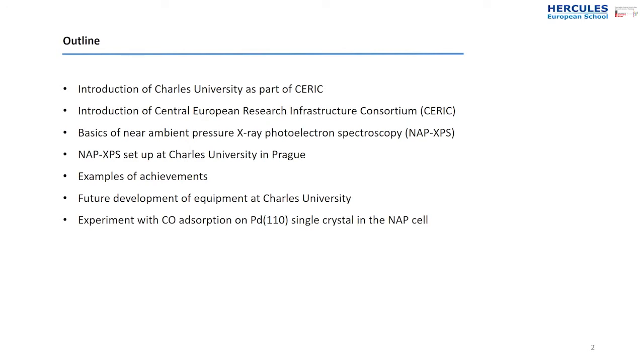I will also talk about the achievements with the other users, the other groups, because it's based on international open access experiments, and tell you about our plans for the future as well. And finally, as I already mentioned, we will conduct experiments with you, which we chose with my colleague: the CO adsorption on a palladium single crystal with a surface orientation 110 in the near ambient pressure cell. So you can get a touch, at least in this way, of the equipment.